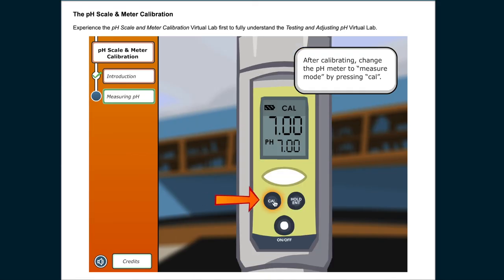After calibrating, change the pH meter to measure mode by pressing CAL.